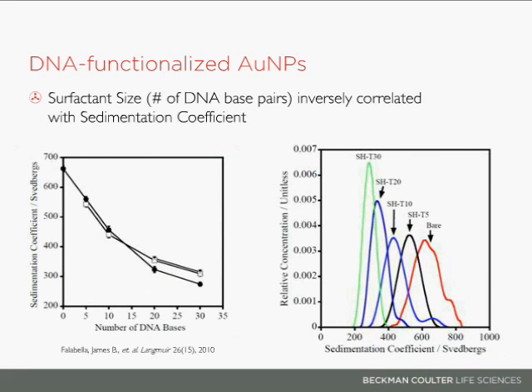Now, a very good case study for using AUC with nanoparticles is carbon nanotubes. There's a groundbreaking work by Arnold et al. in ACS Nano in 2008 where they studied the effect of carbon nanotubes coated with sodium cholate with AUC. Now, a brief background of carbon nanotubes.